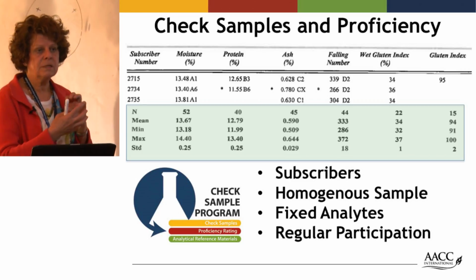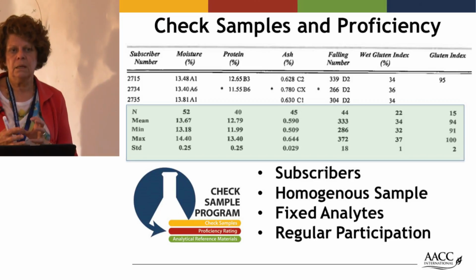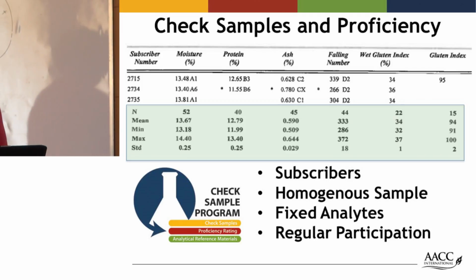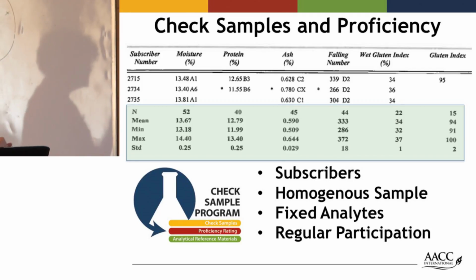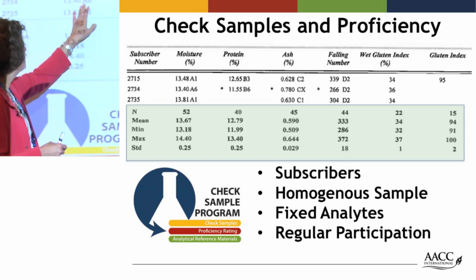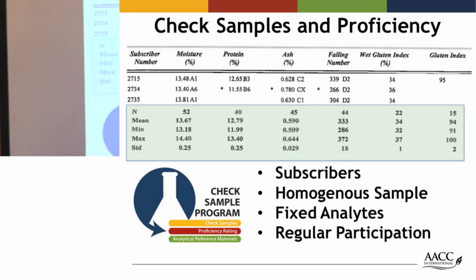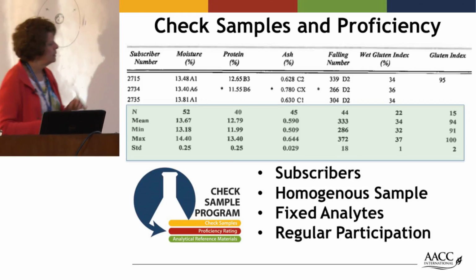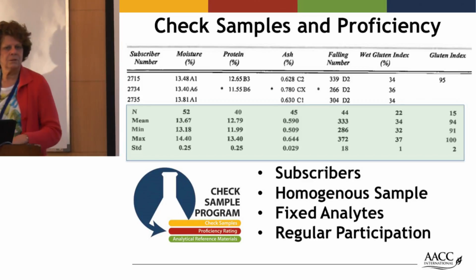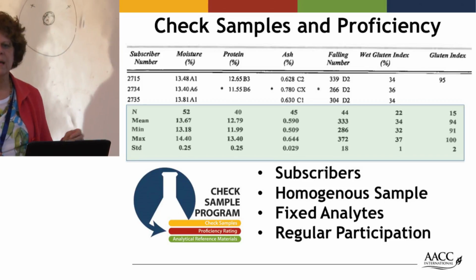So this is a way you can compare how your laboratory is performing with respect to other laboratories. And it's this type of thing that is very important when you're in a trade situation. You need to know if every time you get a sample, you're below. And so it's important that when you get the results of this analysis, you actually do a root cause analysis if you're below. You need to find out why it is you're below.